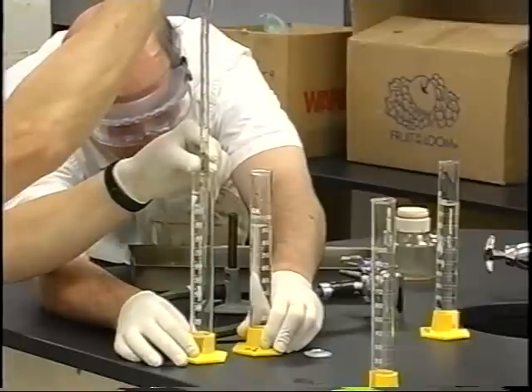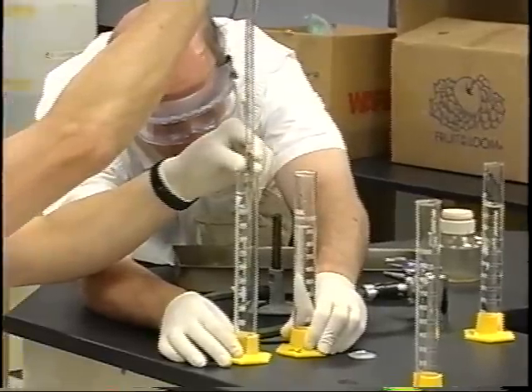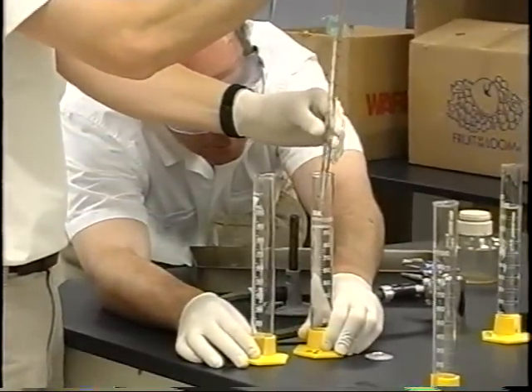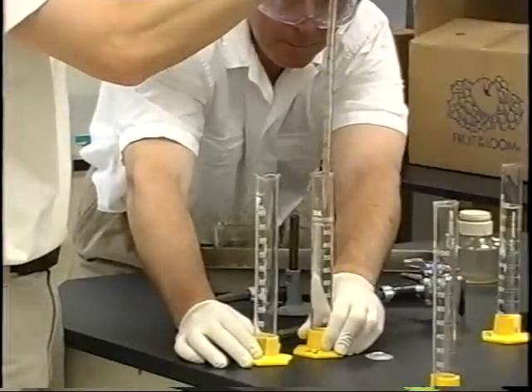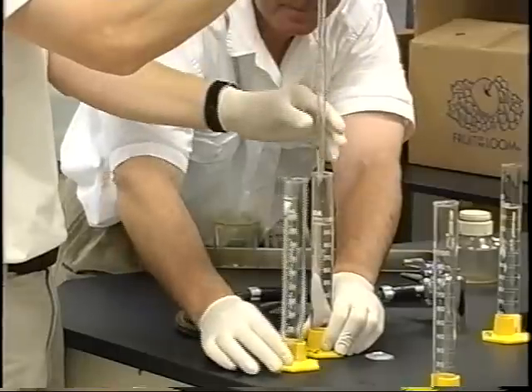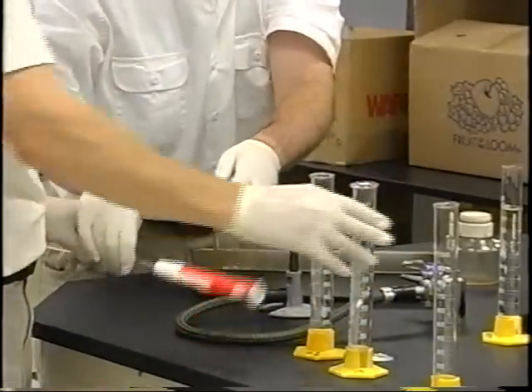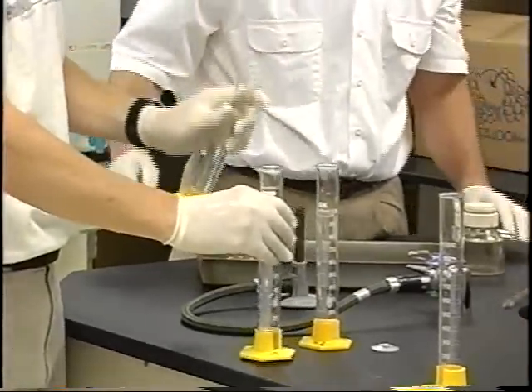Going from 6 to 7, adding 1 more ml. The rest goes back here. So what I've still got here is 100 mLs of water, and I'm about to have another dilution made.